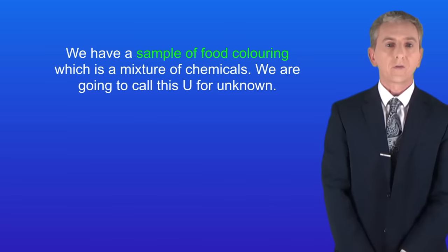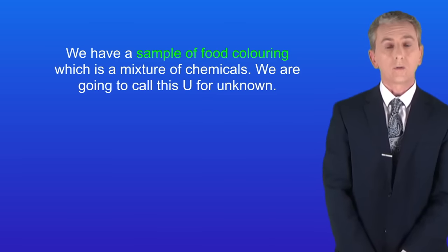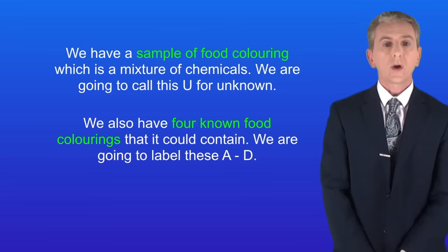We've got a sample of food coloring which is a mixture of chemicals. We're going to call this U for unknown. We also have four known food colorings that it could contain and we're going to label these A to D.